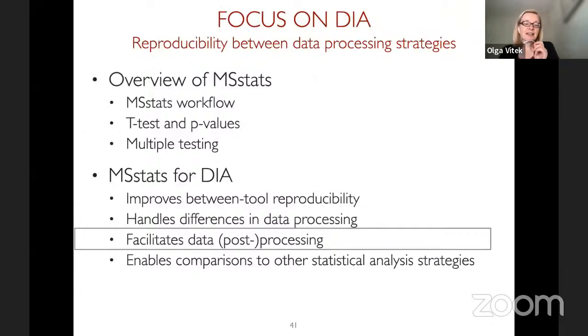So this is one vignette. We can work with the data processing matters. Some extent of outliers we can handle, in which case we have fewer differences between the tools. However, there's no magic, and some of the upstream data processing definitely has an impact on our conclusions.